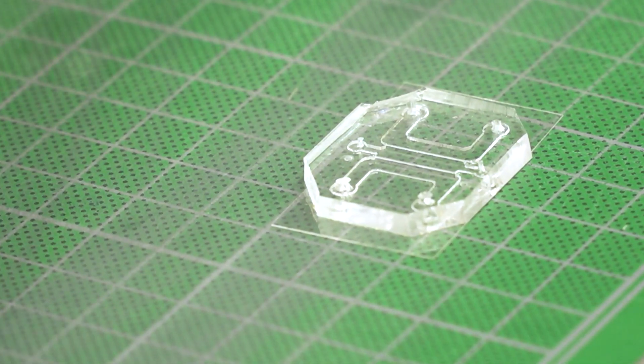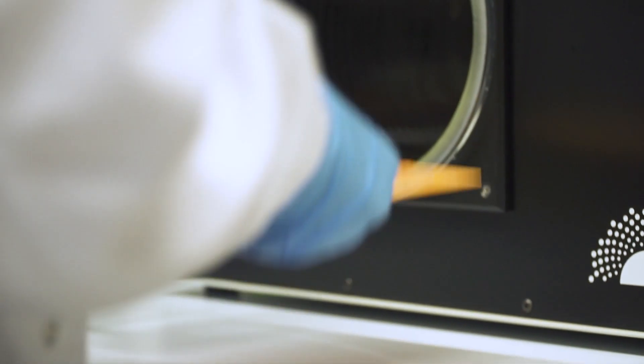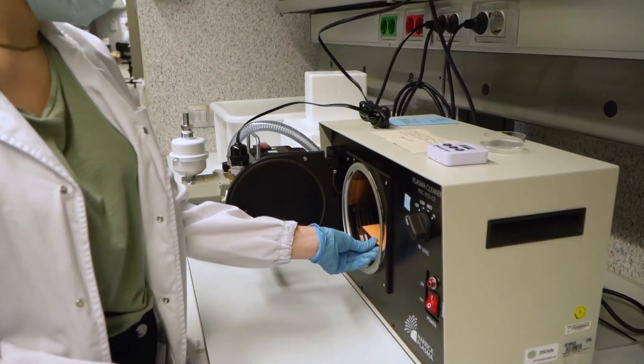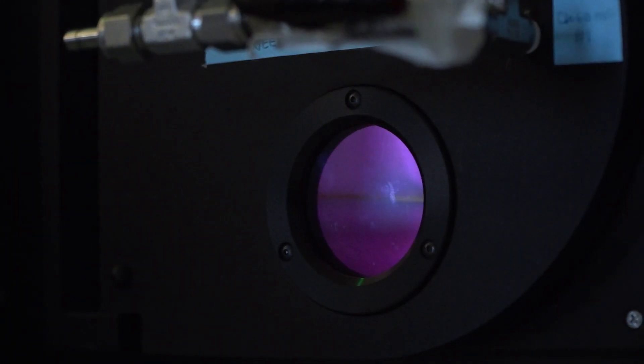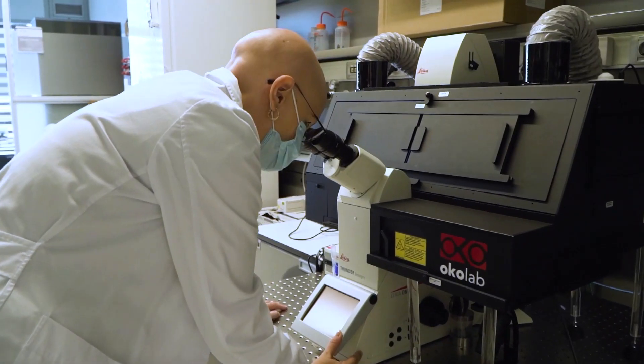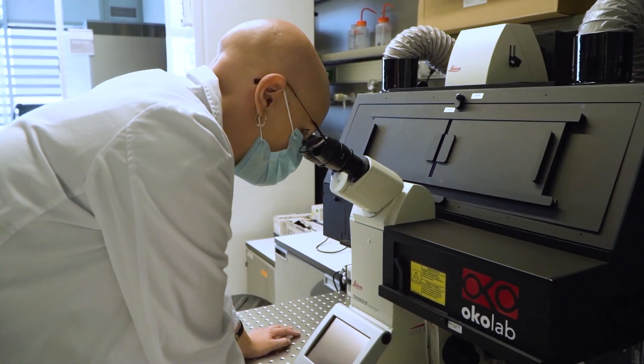Then we bond the device on a glass coverslip with air plasma. The optical and oxygen properties allow us to check the cells inside the device with any inverted microscope.